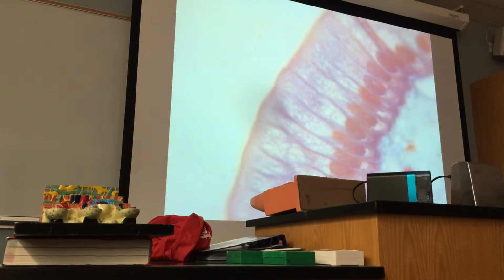These are multiple structures. These are the extensions of the cell membrane. And these are microvilli, but you cannot see the individual microvillus because it's beyond the resolution of light microscope. So you see instead the brush border, or you could call microvilli. Remember, villus is singular, villi plural. So microvilli. One microvillus, two microvilli.